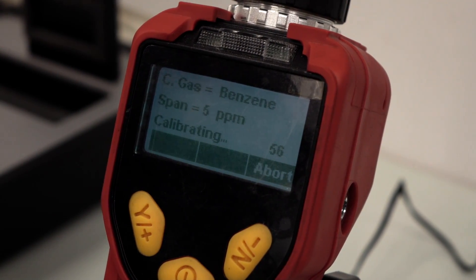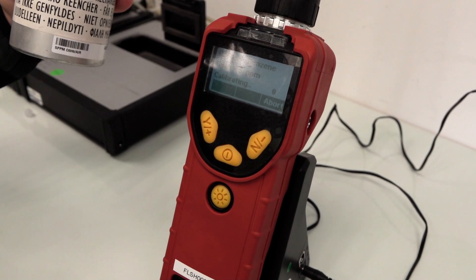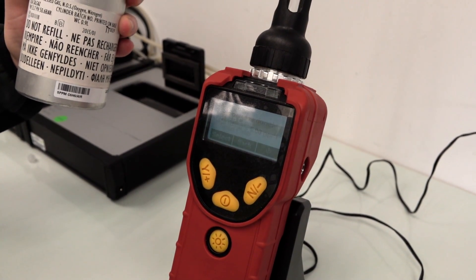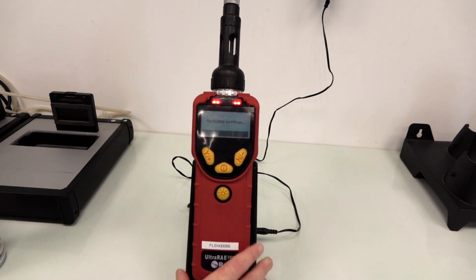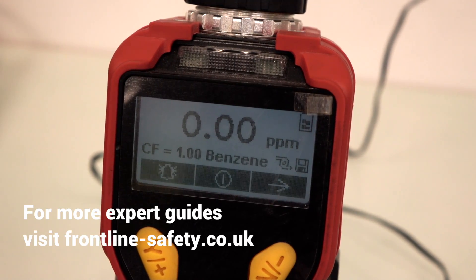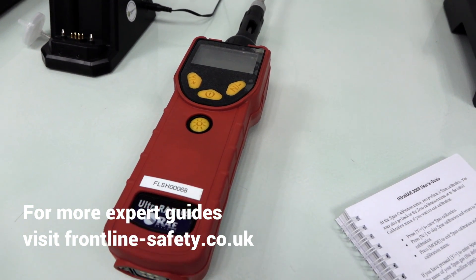The unit's internal pump will draw the relevant sample from the gas cylinder over a 60-second countdown. After 60 seconds the calibration is complete. You can now exit the calibration menu. However, if the gas is still attached to the unit it will go into alarm. Simply remove the tubing from the probe along with the separation tube, which you should dispose of in accordance with your site rules. The Ultra Ray 3000 is now calibrated for benzene and ready for use.